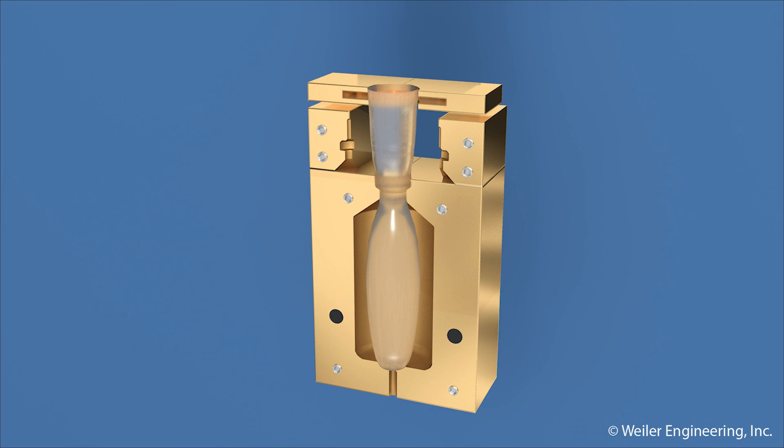The bottom of the parasin is then pinched closed while the top is held in place. The blow-fill nozzle is lowered into the parasin forming a seal with the neck of the mold.